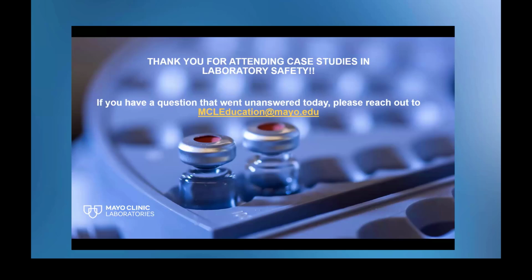For PPE, can you please clarify requirements for footwear in the laboratory? So in the clinical laboratory, what we require is a closed toe impervious shoe that completely covers the foot and the heel and all parts of your feet.